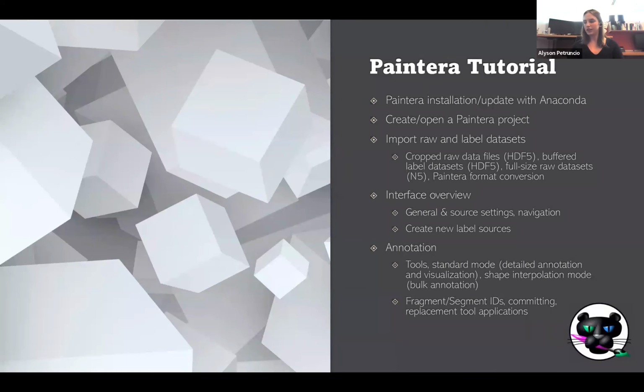All right, so enough context. Now, here's the outline for the Paintera tutorial. First, we're going to walk through Paintera installation and what Paintera updates would look like, and this is all done using Anaconda. We're going to learn how to create and open Paintera projects, and we're going to do this multiple times to run through multiple applications.